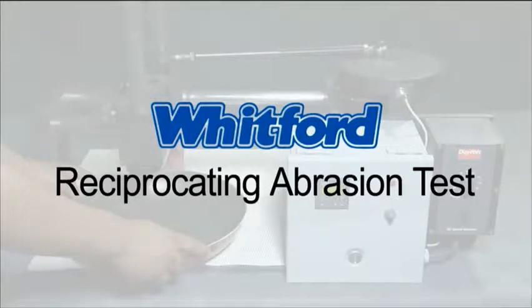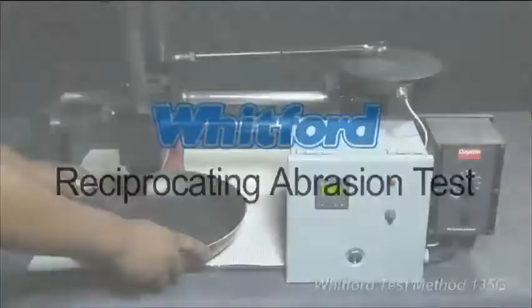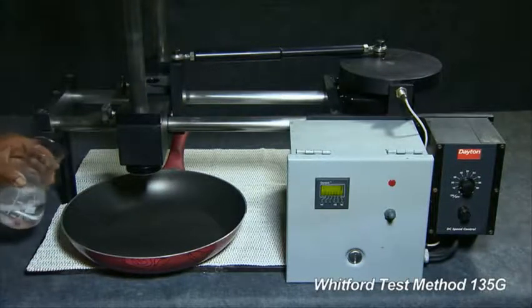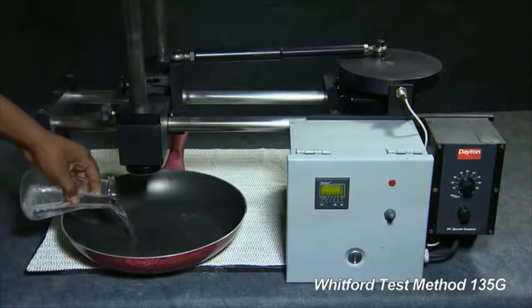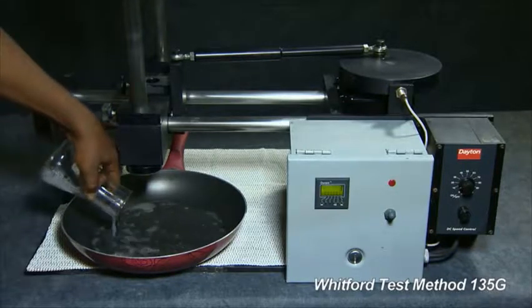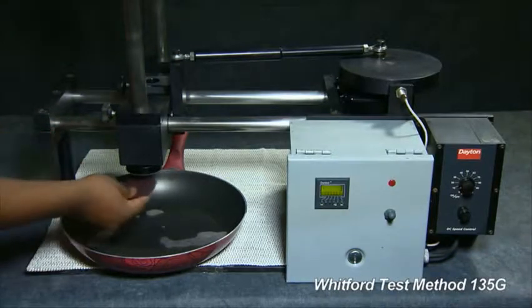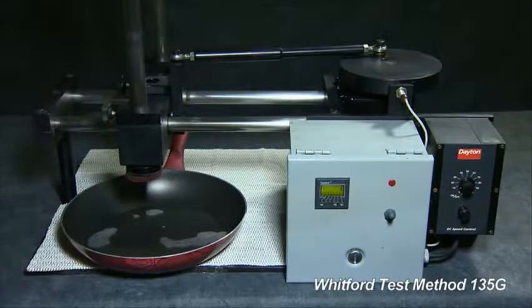This is Whitford's Reciprocating Abrasion Test. Place a pan onto the machine so it cannot move. Add water with 0.5% Triton X100. Cut a standard Scotch-Brite pad and attach the pad to the stylus.